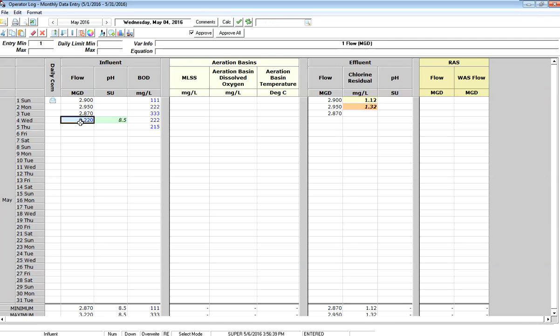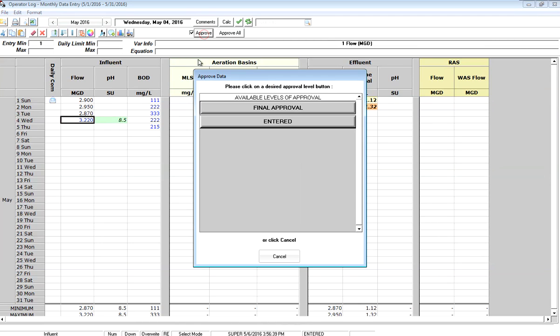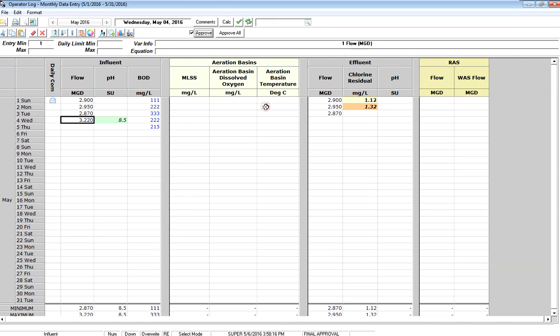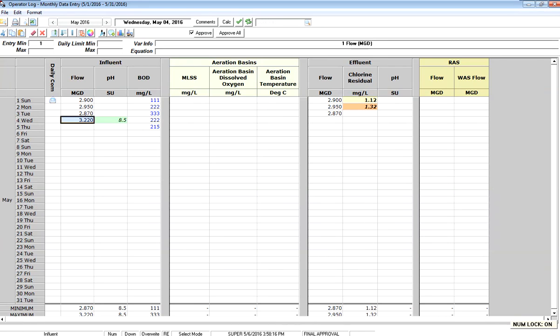Data approval has been set up on that parameter, and since I have the rights, I can simply click and say I want to approve that data. The data becomes black in this case, indicating that now that data is at final approval level.